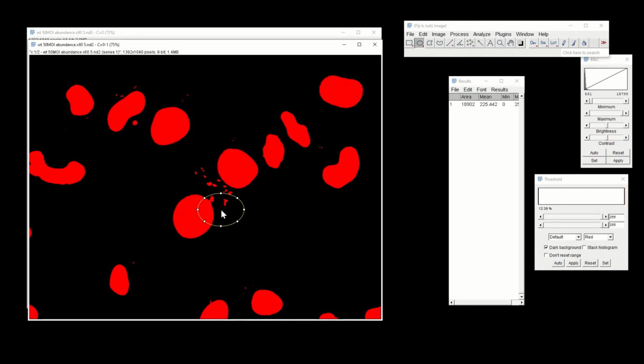Now let's take this little shape here and carry it over here, adjust everything. We're just basically going to measure a few of them to get a rough idea of how big these objects are. I'm going to drag it here as well. Maybe we're not going to do this. Maybe I'm going to pick this shape, just to be a little more accurate. And now I'm going to again click on Control M, and so you get this idea. So this is around 13,000, this is around 19,000. So these are the kinds of sizes that we are dealing with.